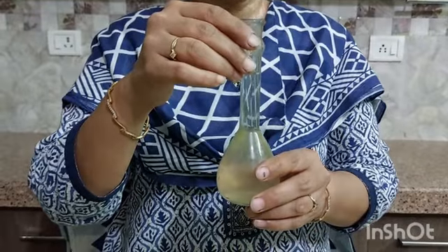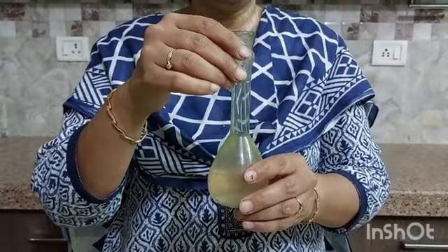Shake well to make it a homogeneous solution. Now this is N/30 solution of ferrous ammonium sulfate.